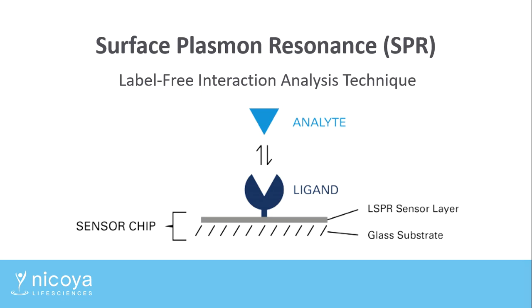The diagram here shows the basic assay format that's used in SPR. So this consists of a gold sensor, which will be performing all of the detection for us. Next, we'll need to immobilize one of the binding partners to the sensor surface, while the other binding partner is going to be free-flowing in solution above.